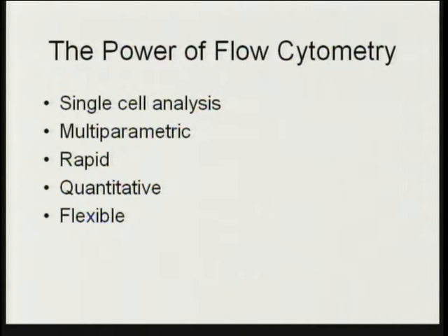It's inherently multiparametric so that one can look at multiple different facets of a cell all at the same time on an individual cellular level, which is a very unique aspect of this technology. In addition, one can acquire this information very rapidly in a very quantitative fashion.